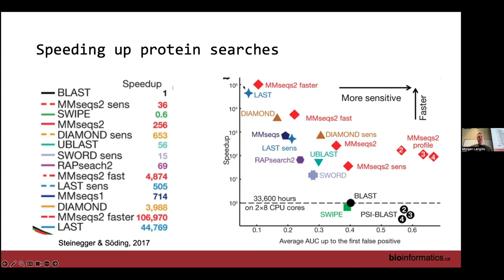All right, the next one I want to talk about is sequencing depth. This is probably the most thorny one. We talked a lot about sequencing depth back in the 16S session. If you weren't there for that, this is the idea that if you've done different amounts of sequencing per sample, that is pretty arbitrary, and should we normalize a bit for that sequencing depth? This varies way more. With 16S, basically yes, we need to normalize by sequencing depth, either by rarefaction or by some sort of transformation like CLR. With metagenomic data, we see everything from nothing, which I would say is almost the most popular, through to rarefaction, and again maybe some sort of transformation as another alternative.